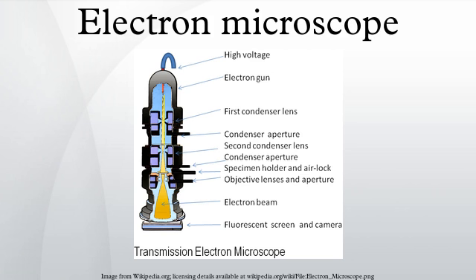Electron microscopes are used to investigate the ultrastructure of a wide range of biological and inorganic specimens, including microorganisms, cells, large molecules, biopsy samples, metals, and crystals. Industrially, the electron microscope is often used for quality control and failure analysis. Modern electron microscopes produce electron micrographs, using specialized digital cameras or frame grabbers to capture the image.